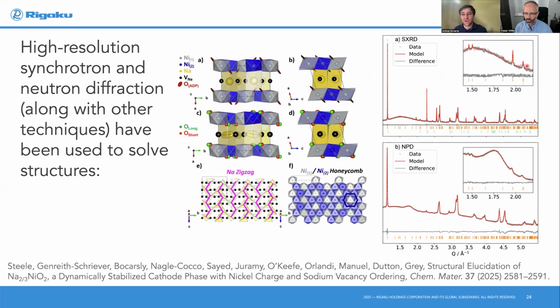And he was able to very carefully model this with Rietveld refinement and come up with a model that fits absolutely beautifully. He also wanted to make sure that he was able to accurately reproduce the oxygens. And so he went and did high resolution neutron diffraction at the ISIS neutron source. And so he was also able to see superstructure peaks even in neutrons.